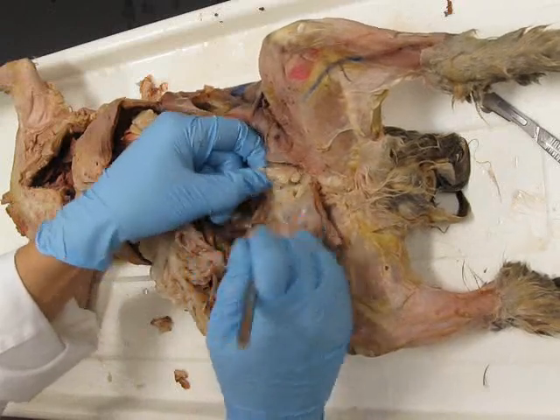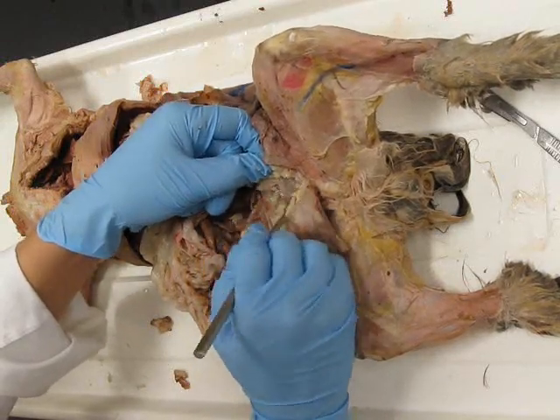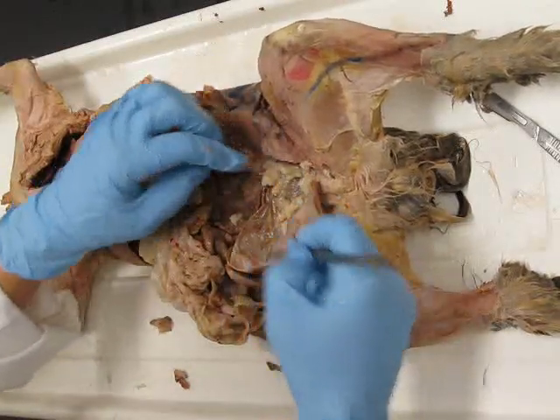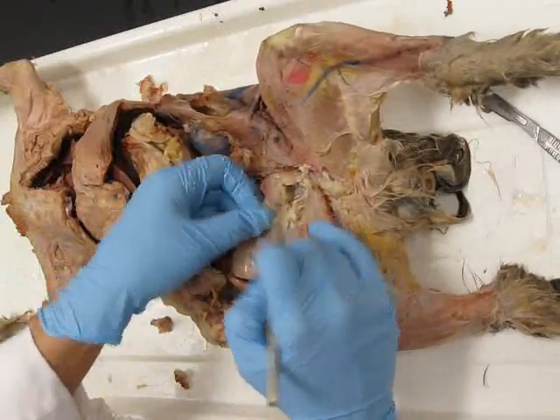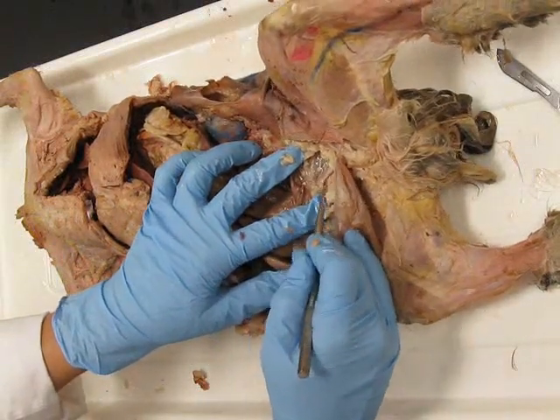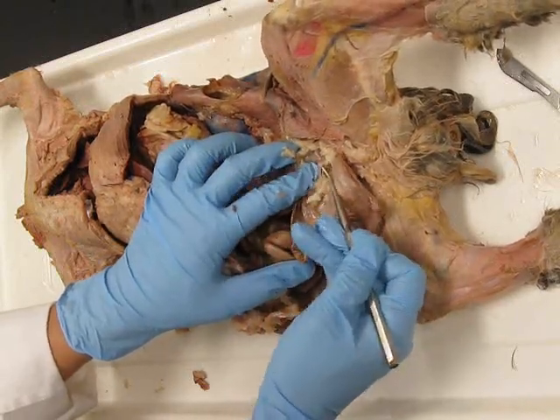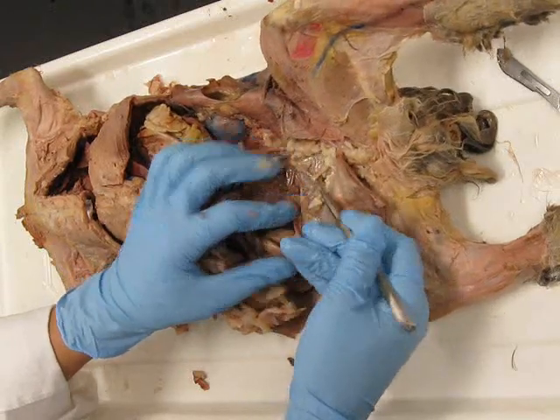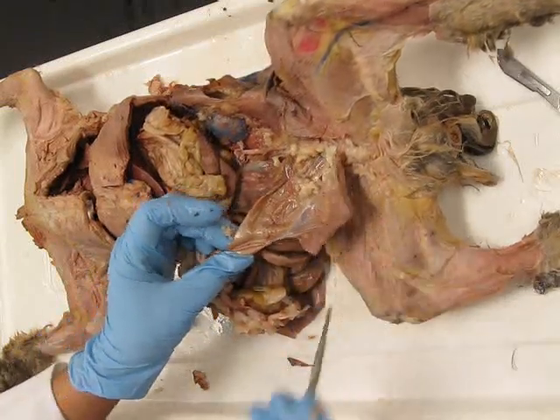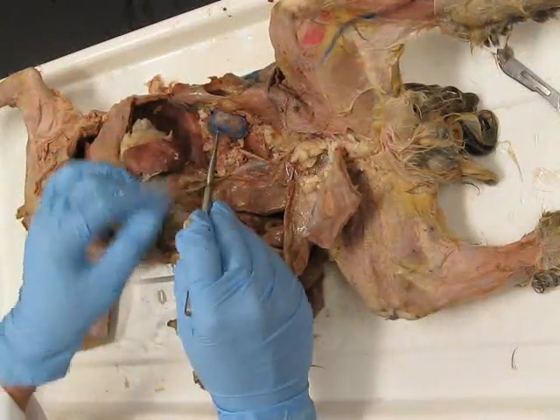Right, so I'm just going through the fat, blunt dissection, and there it is. Okay. Alright. Now, once you're down through that fat, you should see the silhouette of a tube down there, which is right here. And you're just going to get underneath that, just like you did the ureter, and clean it by running the probe along it. Like this. All these little tiny blood vessels, we don't care about those. Okay, so here's your urinary bladder, tube coming from the bottom, urethra. Okay, urinary bladder, median umbilical ligament, ureter, kidney, adrenal gland.